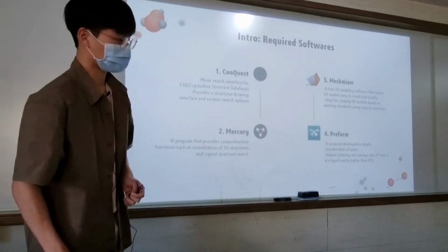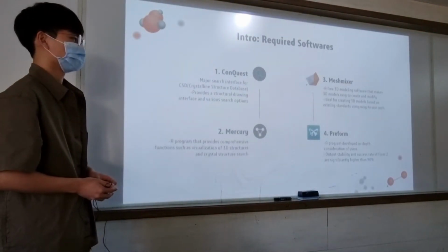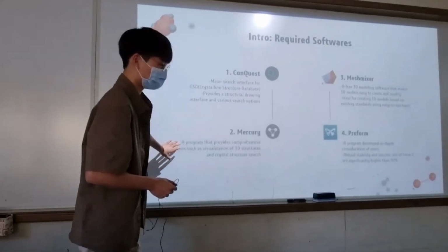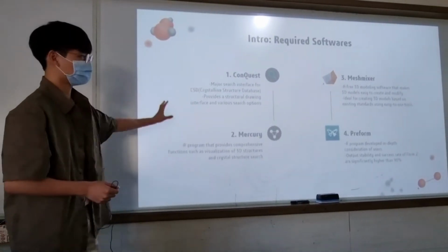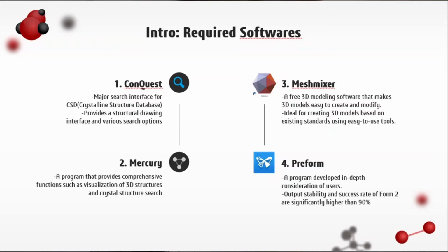I'll tell you the software and procedures on how you should make and design the subunits. So first of all, ConQuest and Mercury. I know you're all acquainted with this program, and Mesh Mixer and Preform might be new to you, but I'll explain shortly.